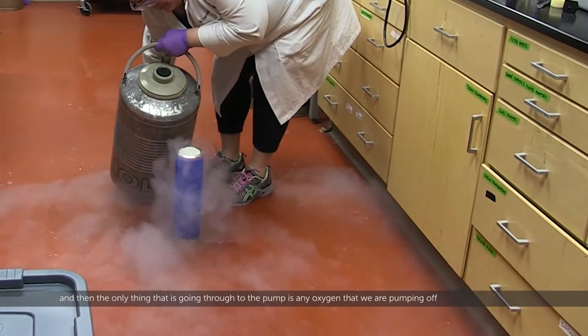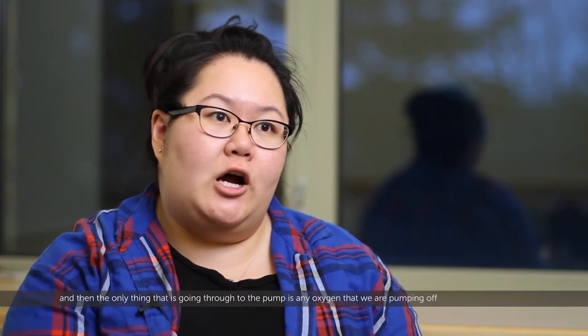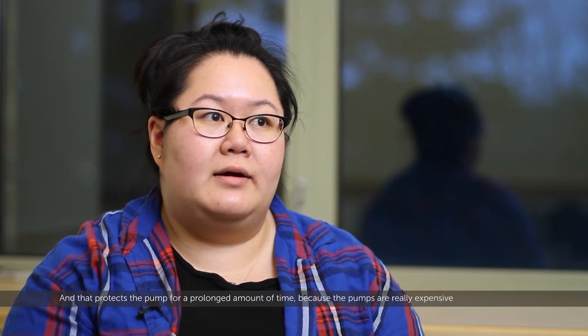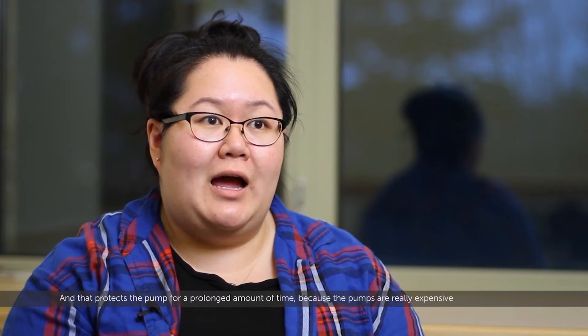The only thing going through to the pump is any oxygen or argon that we're pumping off during a pump-purge cycle. That protects the pump for a prolonged amount of time, because the pumps are really expensive and we don't want to damage them in any way.